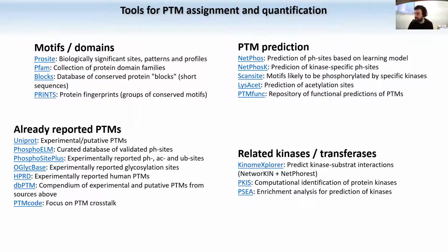And finally, I'm going to leave you this table. It's almost 9 a.m., so we're going to stop soon. I'm going to leave you this table where you can see which software to use to extract motifs, which software to use to extract, for example, predictions of localization of modifications, information about modifications that we already know, information, for example, about what kind of kinases are involved in X and Y, depending on the motifs that you find to be enriched.